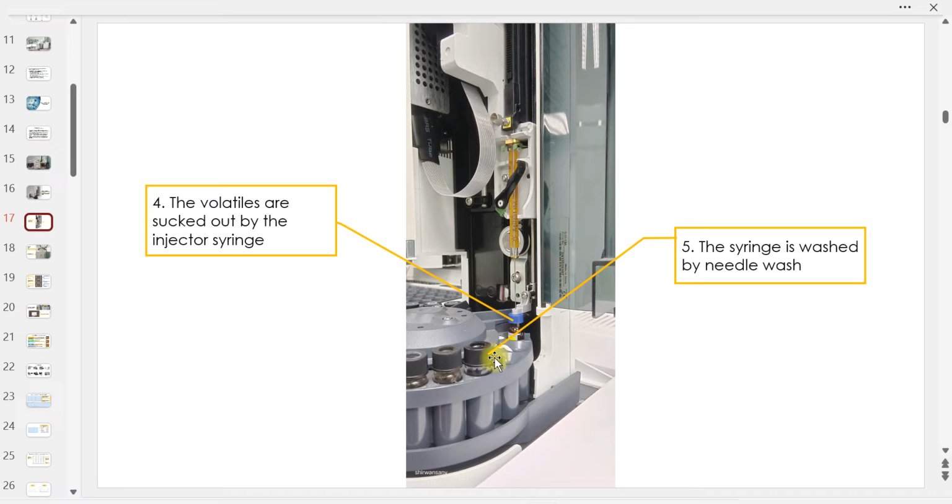So my recommendation, kalau you kena beritahu macam saya dulu, saya akan tanya klien saya, you dissolve dalam apa? Kalau dia kata methanol, so I will change this wash, masukkan methanol sebagai wash untuk needle tu lah. Pyridine pun sama. Tapi saya rasa kalau susah cari, contohlah pyridine mahal, pyridine dengan hexane boleh bercampur. So boleh gantikan hexane sebagai wash kalau you pakai pyridine. Maksud dia cari yang miscible solvent lah dengan solvent yang kita pakai for extraction.